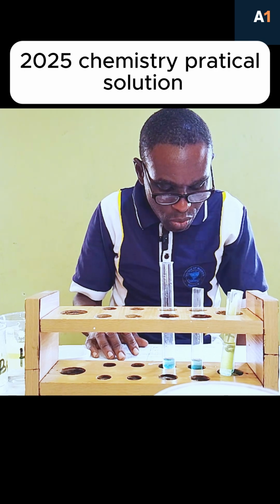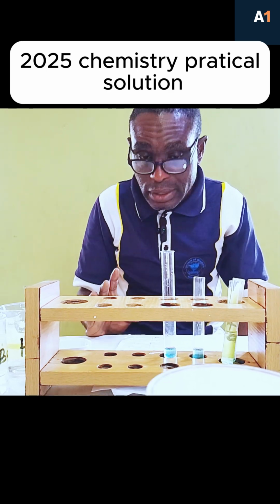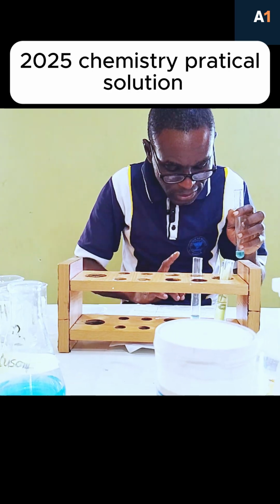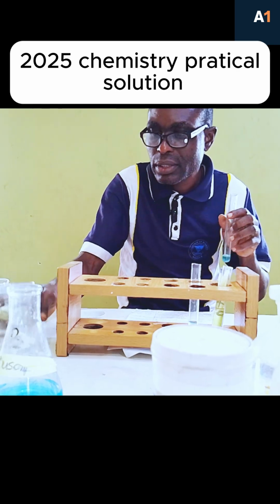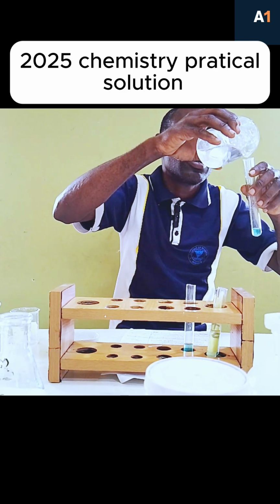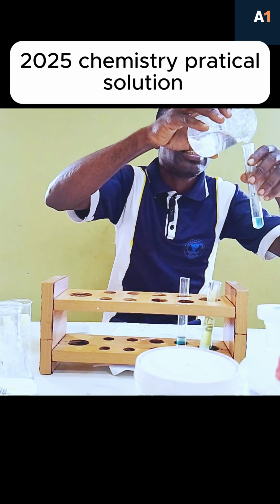The third one, we are asked to add barium chloride, and as well hydrochloric acid. That is what we are doing. Now this is the third one. Now barium chloride. Let's look for the barium chloride. The barium chloride is this. Let me show you the barium chloride in drop. This is in drop. You can see. Then let's now look at it in excess.